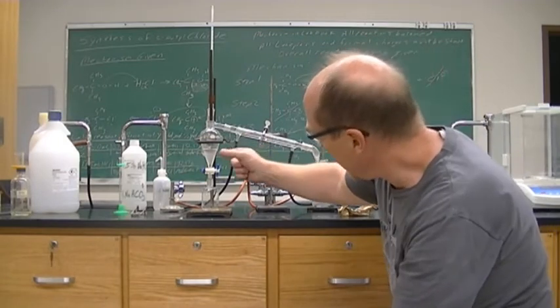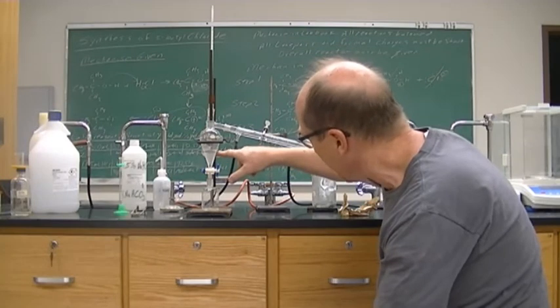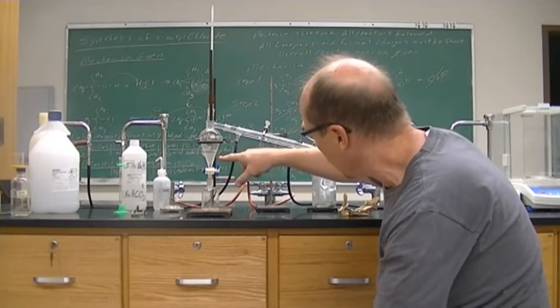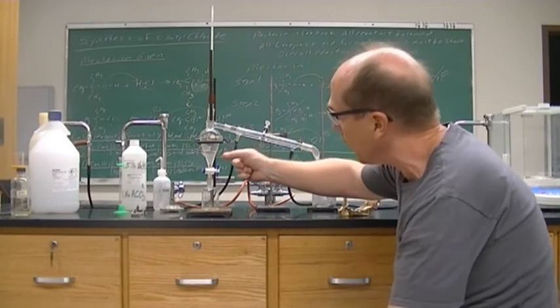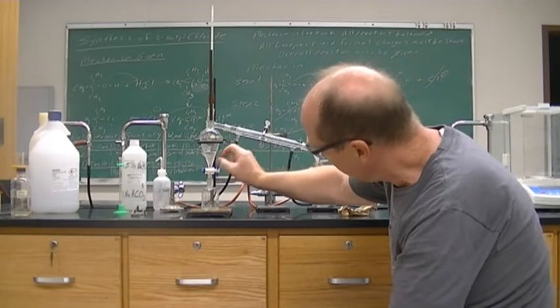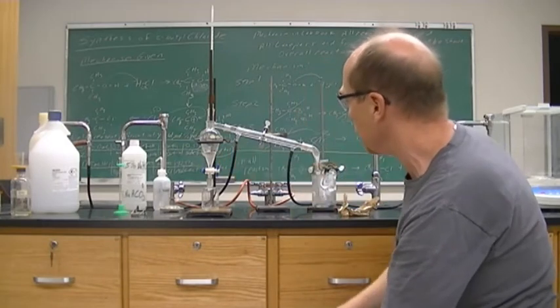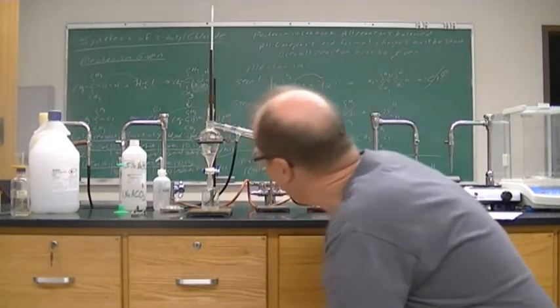So as it comes down, there's less volume. You might be able to see it in the video, you might not, but that clear layer is going to be getting bigger and bigger because the volume that it is taking up is the same, except down here it's a smaller diameter, and so it's going to then look like a larger amount.